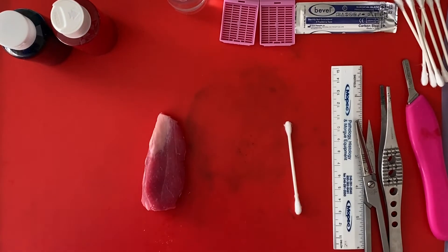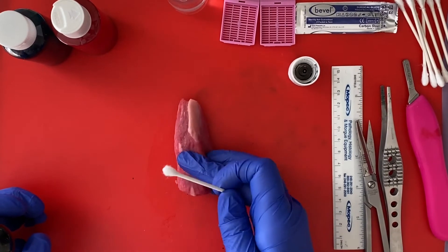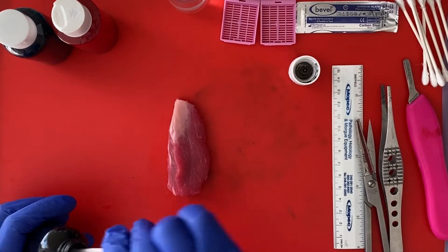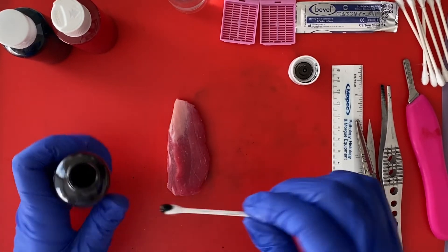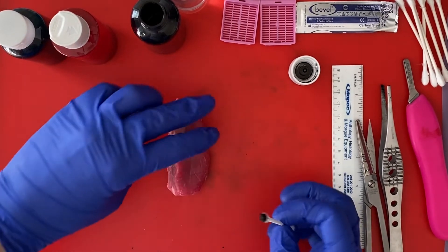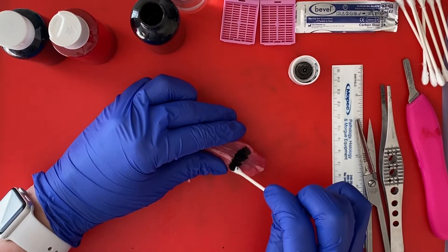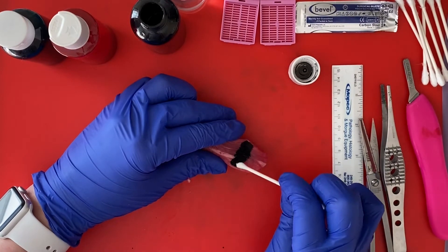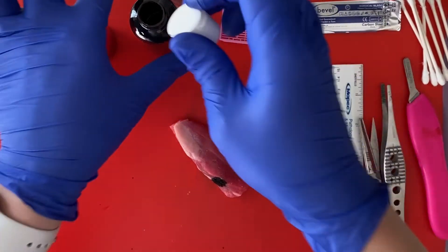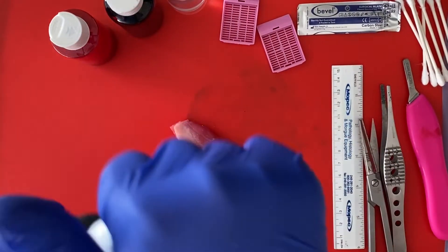I'm going to do black for my isthmus margin. Obviously with this piece of steak, everything on the medial aspect looks the same. But when you get a thyroid specimen, you'll usually have some cautery artifact on the isthmus margin and it usually protrudes just a little bit. I'm going to ink my isthmus margin here one color, and then ink my anterior thyroid capsule and my posterior thyroid capsule each their own color.